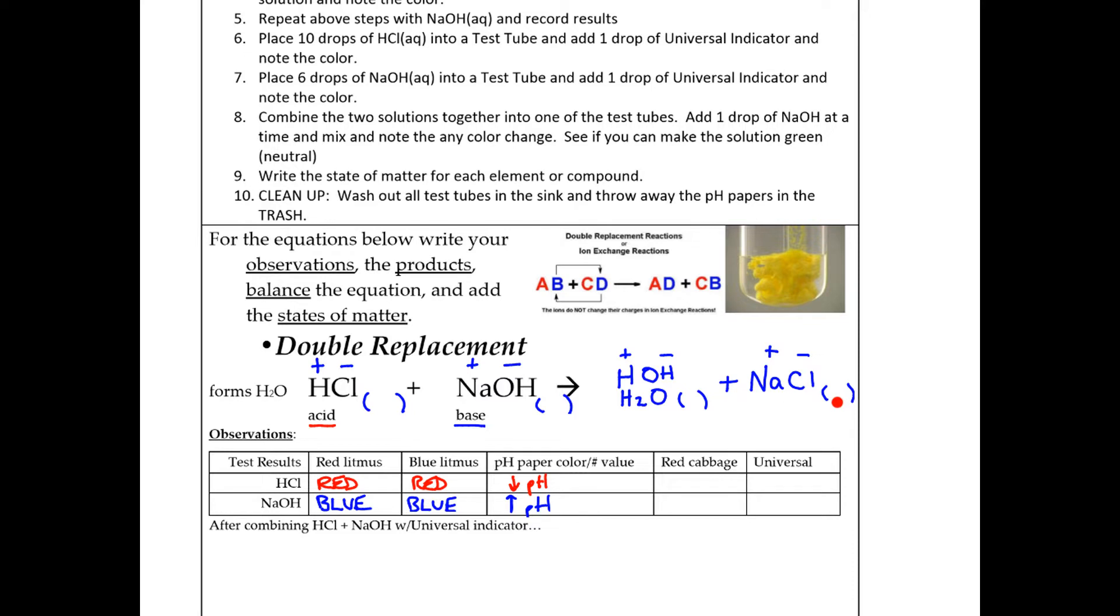So you're not going to see anything happen. When you make liquid water and aqueous salt out of aqueous HCl and aqueous NaOH, there is no visible change that you will ever notice, which is why we're doing this slowly over here on the bottom. You should have had your observations with the universal indicator. Universal indicator really goes through all the colors of the rainbow.